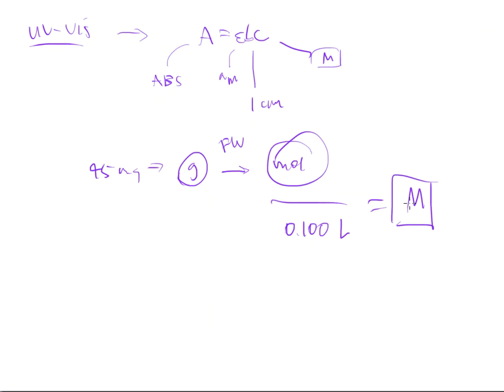So if I'm after molarity, that is mole per liter. So I've taken the caffeine residue, I've dissolved it. I know how much was there because I took a mass of it before we did it. I'm going to assume all of that was transferred over. So that milligram amount can be converted to gram pretty easily. That gram can go into mole because that's the common language that all these things talk with. And once I have mole, divide that by 0.1 because that is what we've made the solution in. So this will give me a molarity number.